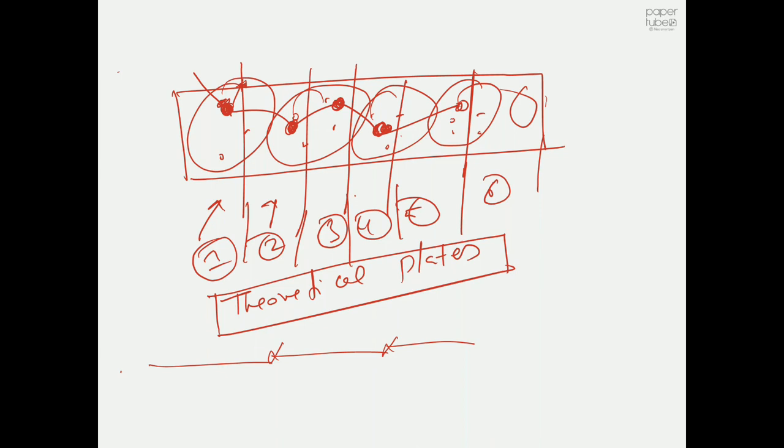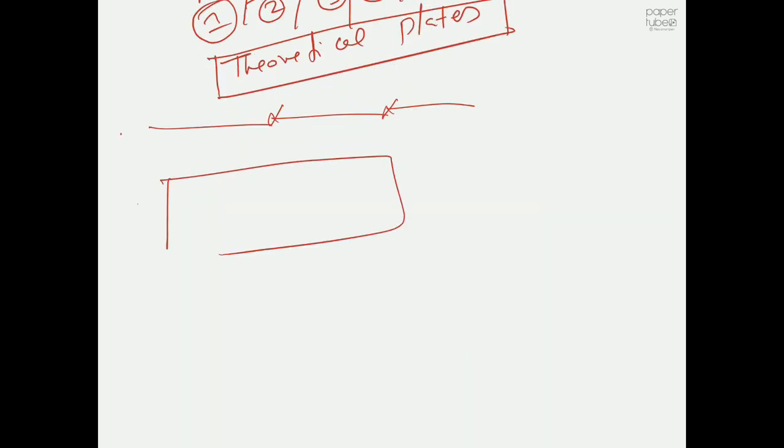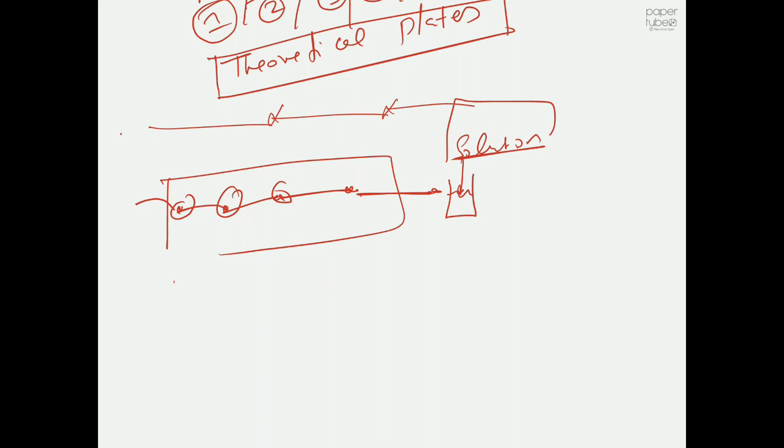And we already know what retention time is. Retention time is related to adsorption plus desorption and so on. But this process is not as simple as you think. In this picture, all I showed is molecules going from one spot to another spot, another spot, and you will get your concentrated solution here. It's not that simple. There are a few more things that we should remember that we will cover now.